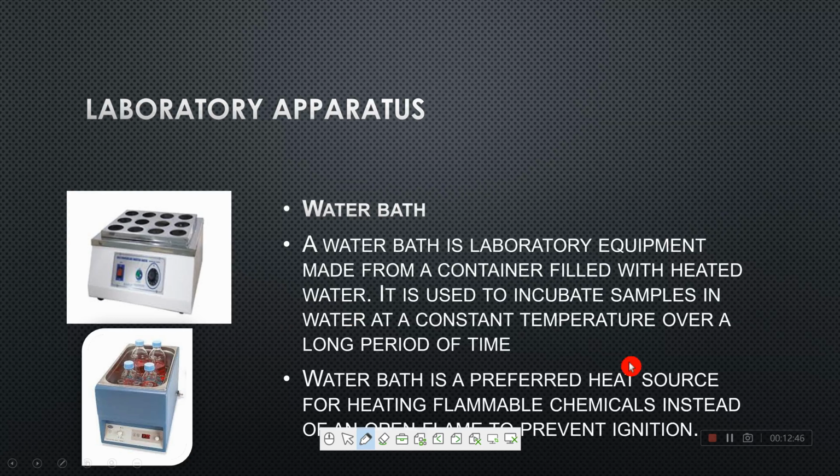Alright, so it is the preferred heat source for heating flammable chemicals instead of an open flame to prevent ignition, because in an open flame the flammable chemicals can ignite and produce heat. So it is also used to incubate samples in water at a constant temperature over a longer period of time.